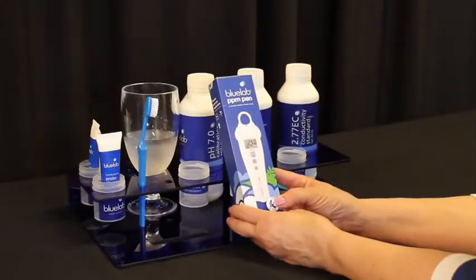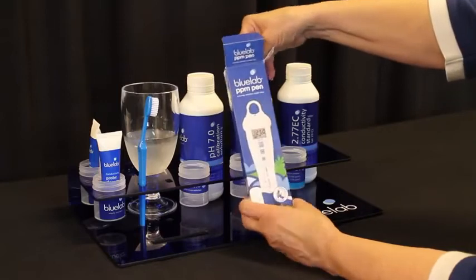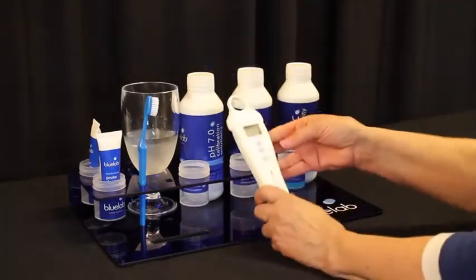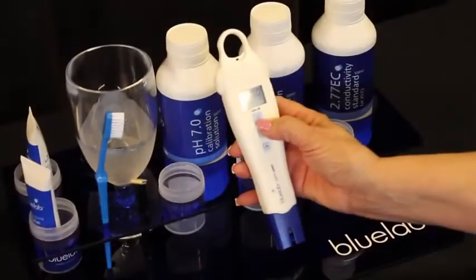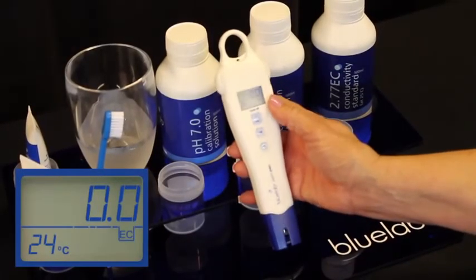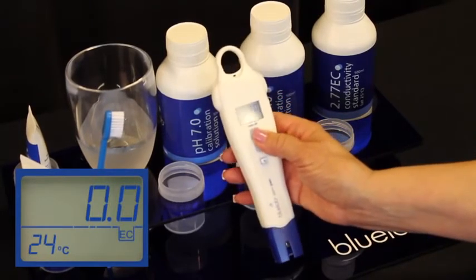Welcome to Bluelab's video on how to calibrate and clean the Bluelab PPM Pen. Remove the PPM Pen from the package. Turn your Bluelab PPM Pen on by pressing the power button. This pen has a backlit LCD display and has a hold reading function for easier reading.